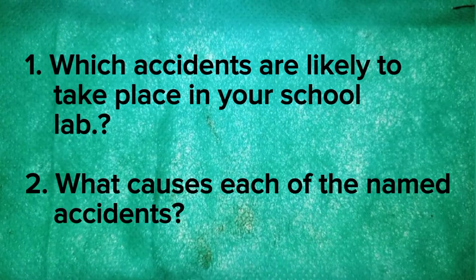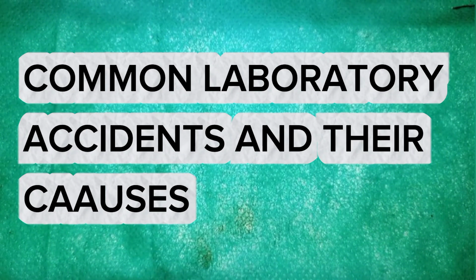Number 2, what causes each of the named accidents? The following are some common laboratory accidents and their causes.